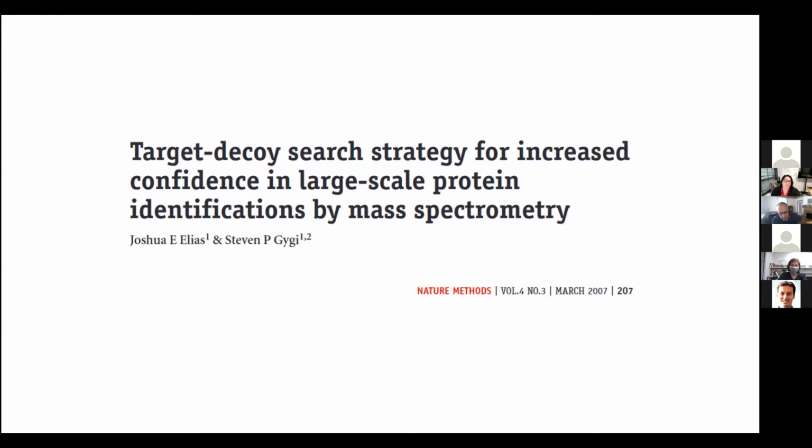Today I'm going to try to give you, in my normal ad hoc way, my understanding of what target decoy searches are in data dependent analysis, talk about how we use them, and talk about ways where they work well and ways where they fall short. Go ahead and fire away questions as you have them.